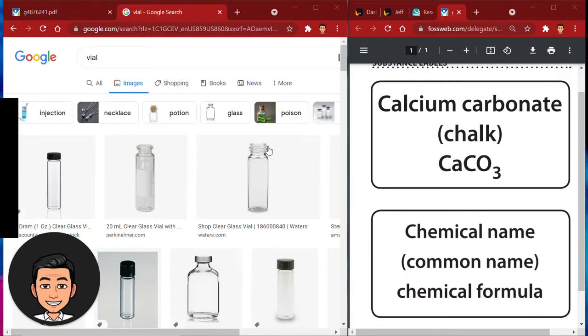Hello, everyone. Today we are going to be making observations on what are called our known substances. So last week we looked at the unknown mystery mixture, but we know it's two different substances. Today we're going to look at our 9 substances, which are known, and we're going to try to compare by observing each and every one of them.